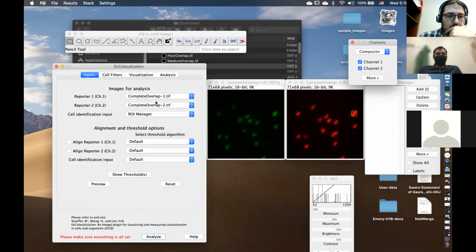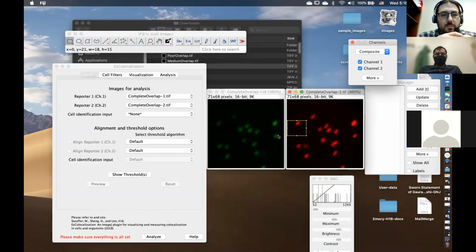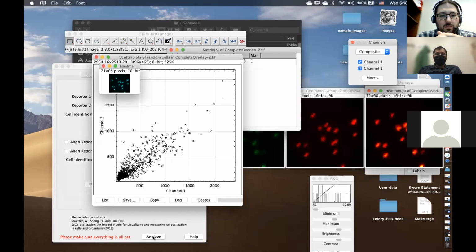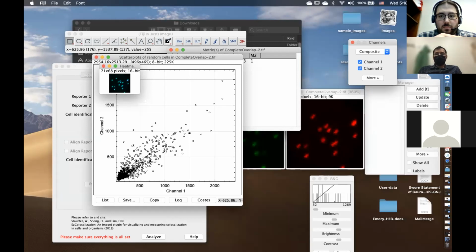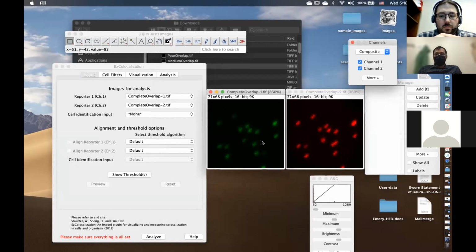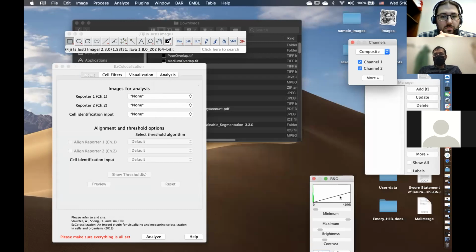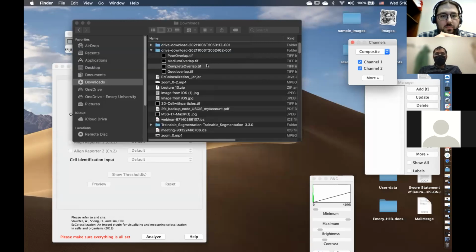Let me go back to my inputs, none. It does work out, right? So I don't know if the limiting factor over here is that set scale, but I still want to try out the original data set with the scaling and try to see how that behaves.